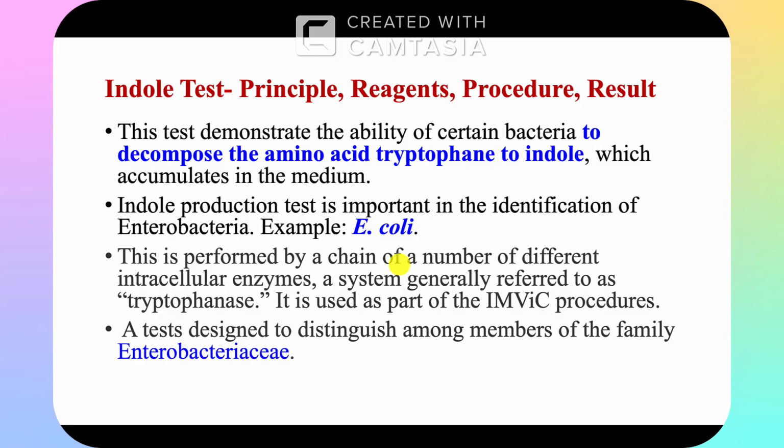With this test we study and identify the ability of certain bacteria to break down the amino acid tryptophan to indole, which is carried out by some bacteria.